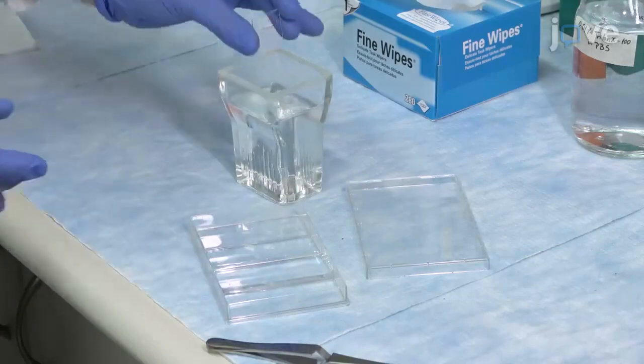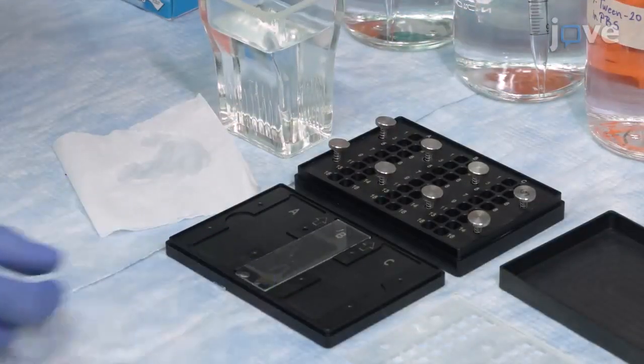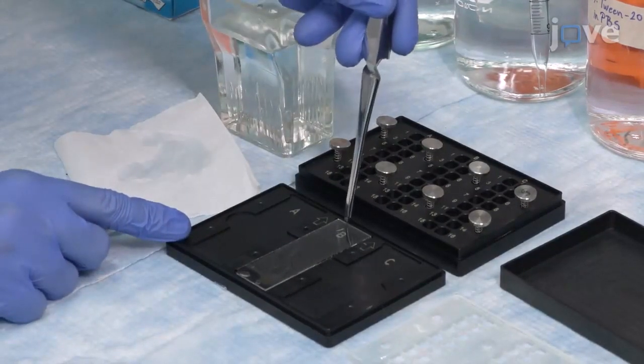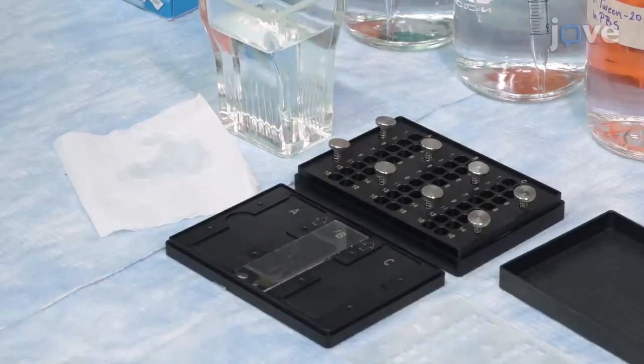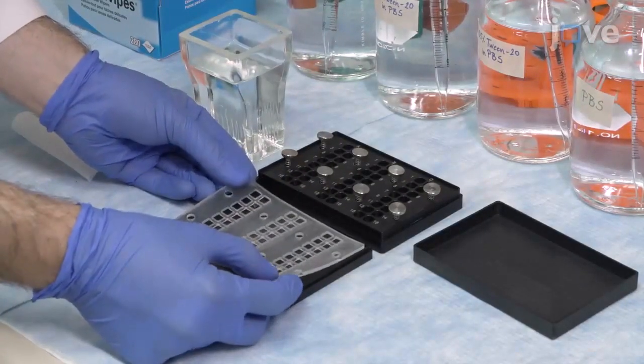This technique combines two approaches: primase DNA binding microarray and primase activity assay. The microarray provides massive data of primase binding to DNA sequences, whereas the biochemical assay provides information on RNA primer formation by DNA primase.